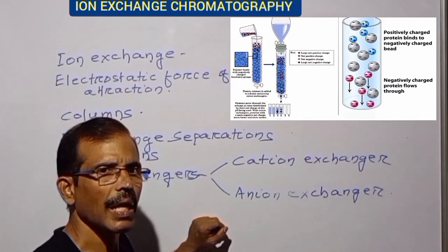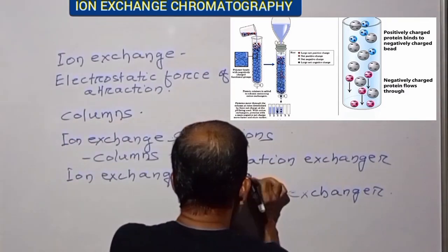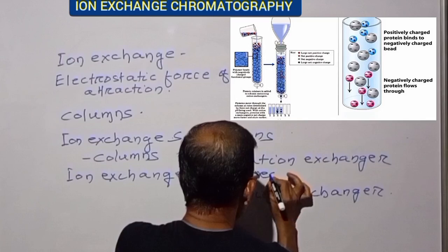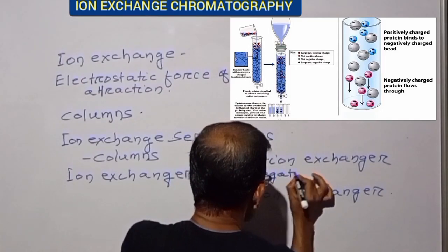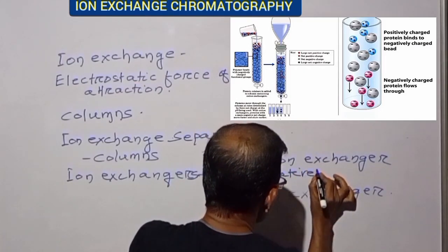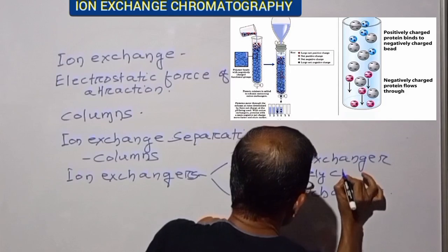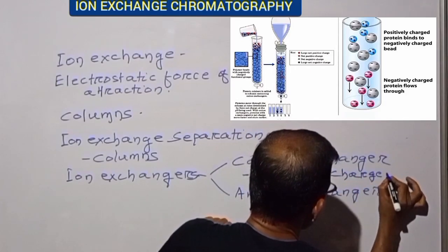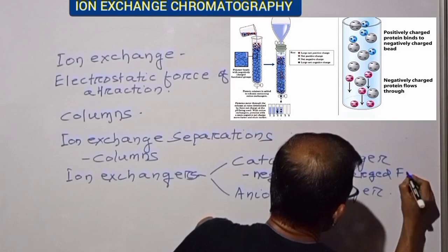In case of cation exchanger, the inert support medium is covalently bound to negatively charged functional groups.